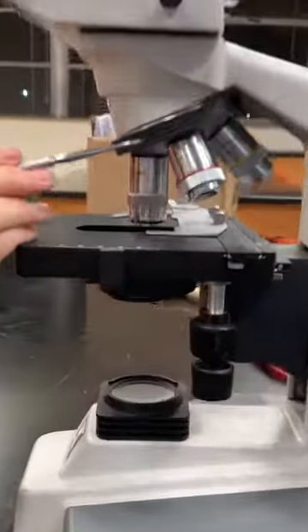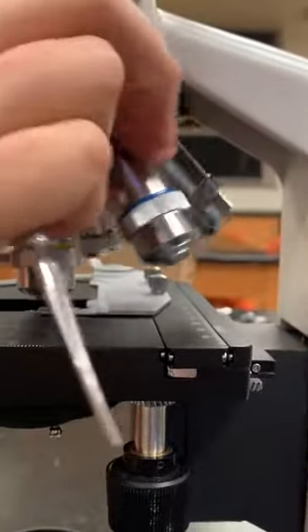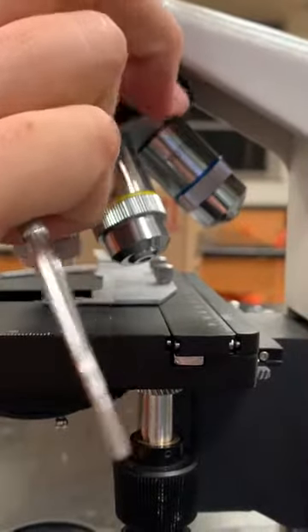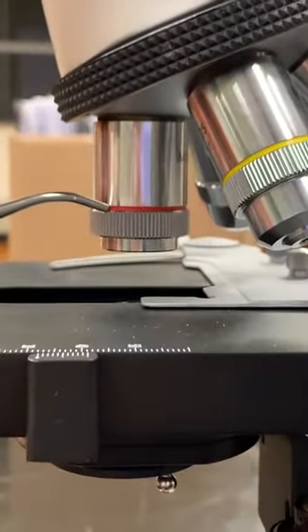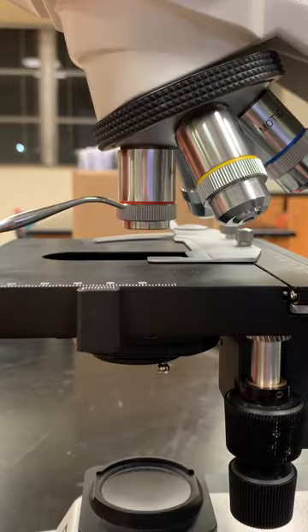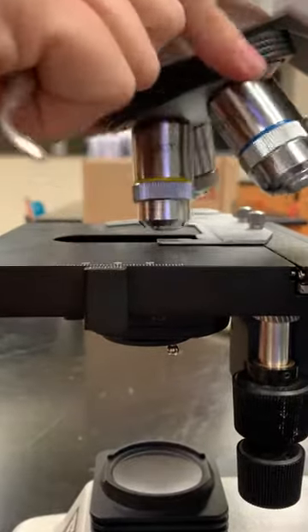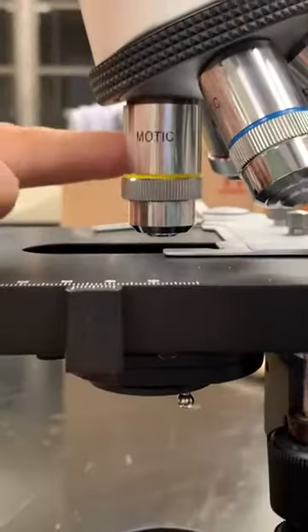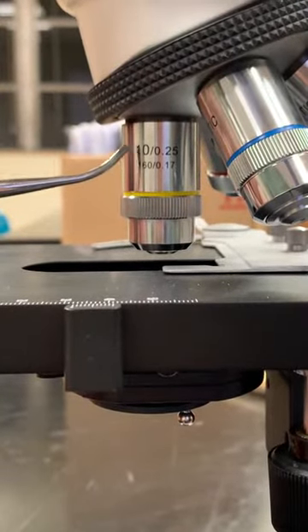The revolving nosepiece is going to move your objective lenses into place. Your objective lenses are color-coded. The smallest one is called your scanning objective lens — it has a 4x magnification. Your yellow one is your low power objective lens — it has a 10x magnification.